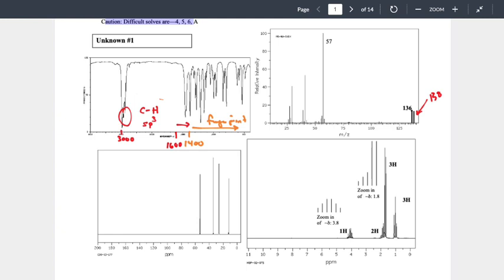Okay? So carbon NMR, what do we look for? Actually, we're going to take a step a little bit back. NMR in general boils down to 4 components. You've got the number of signals, where the signals appear, the area underneath the curve of the signal, and how many times the signal breaks apart. So 4 pieces of information.